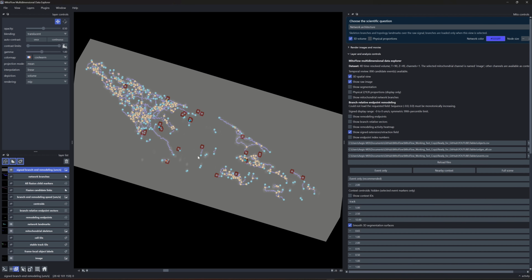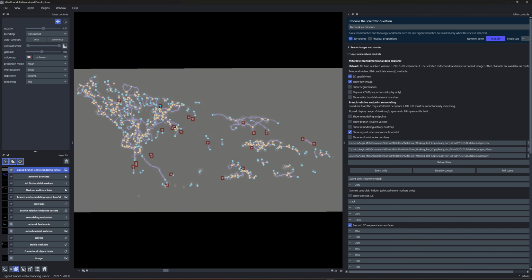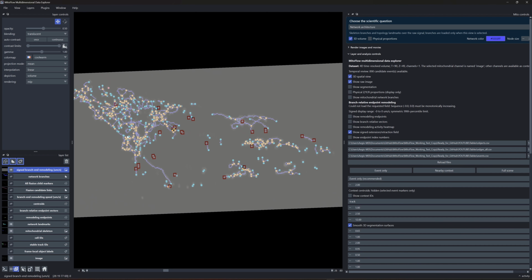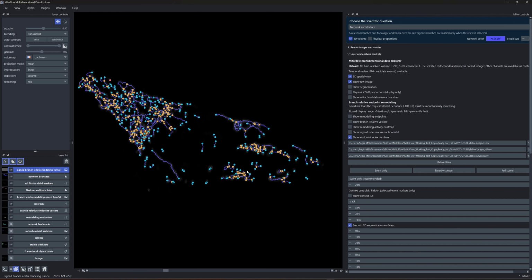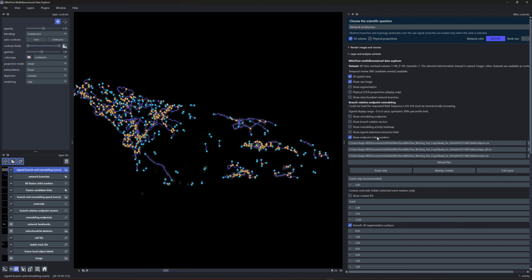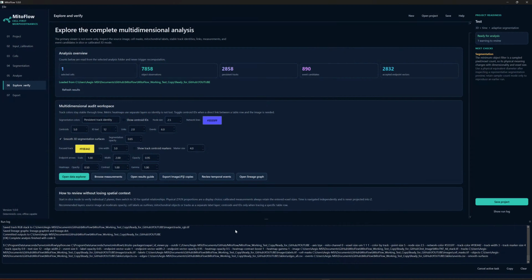Okay, so there are a lot of these individual visualizations that I have because I need to be able to confirm. And the best way to confirm certain events that are happening is through visual verification. And if you have the background selected properly, you can also see the index of each of the endpoints. Okay, so I'm going to go ahead and close out of this one.